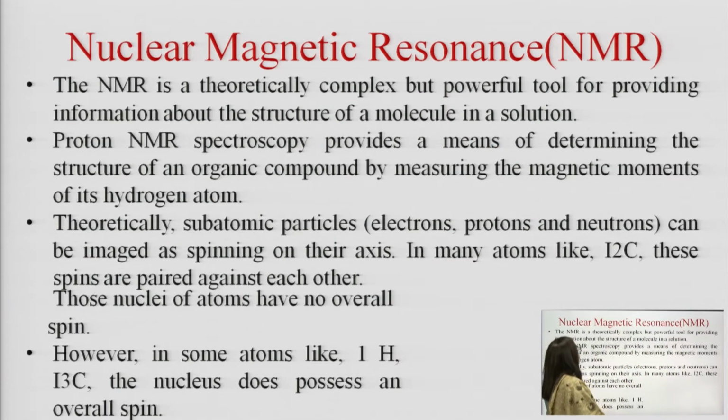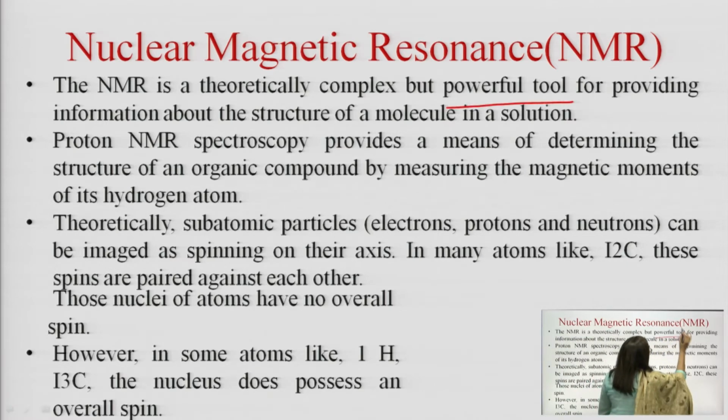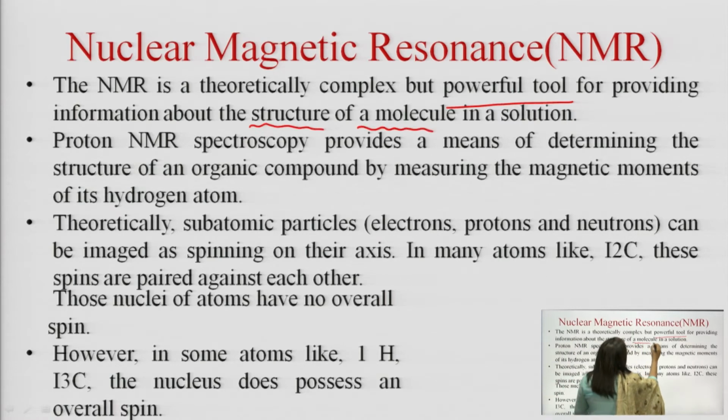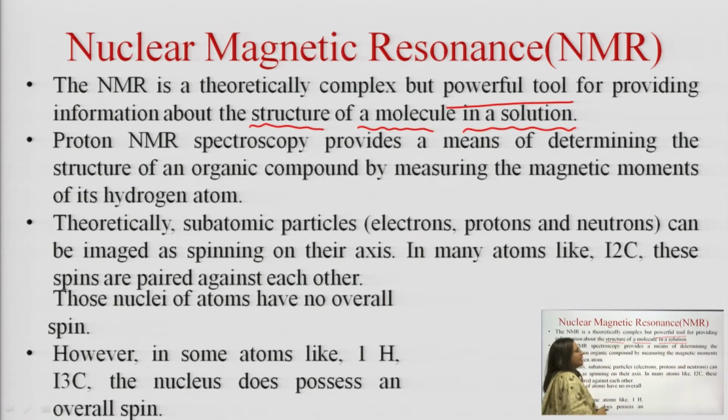NMR is a theoretically complex but powerful tool for providing information about the structure of a molecule in a given solution. That suggests the analyte is to be dissolved in the solution before exposing it to the magnetic resonance.